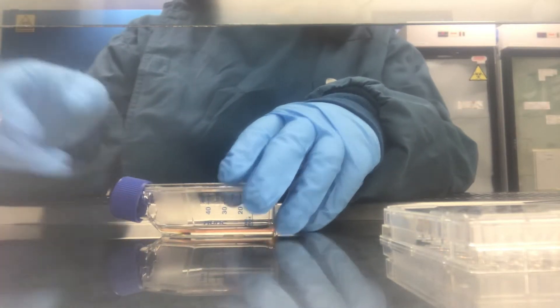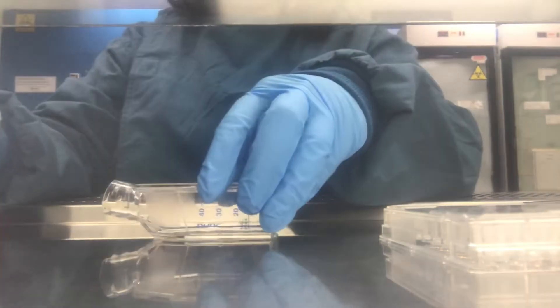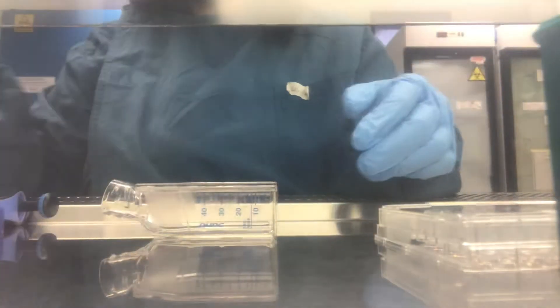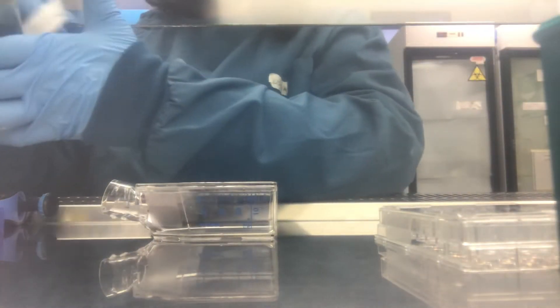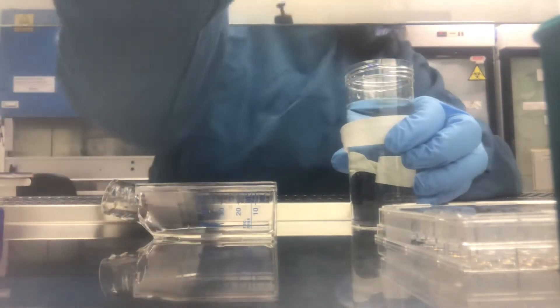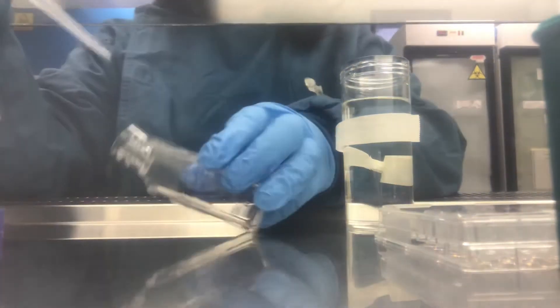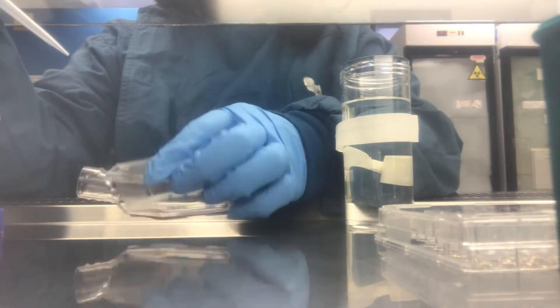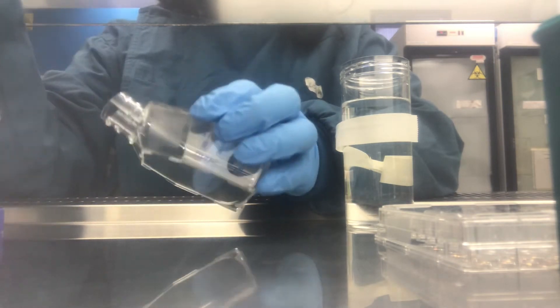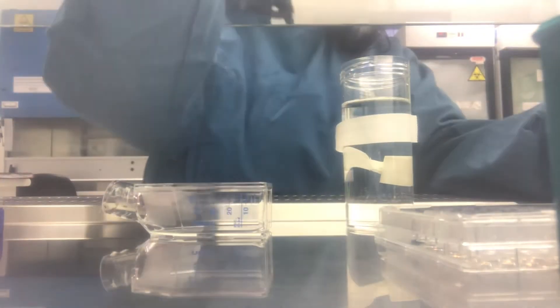Hello everyone, today we will know how to do cell counting. First, get your flask and discard the media. Then get your PBS to wash the cells so that you can get rid of any floating debris. Add around one ml of PBS to the flask, just cover the surface area, and then discard it.